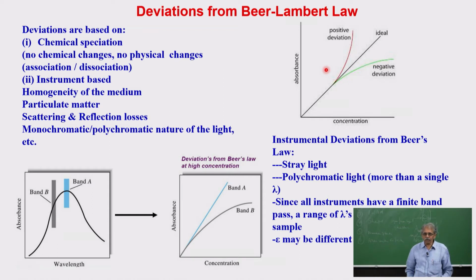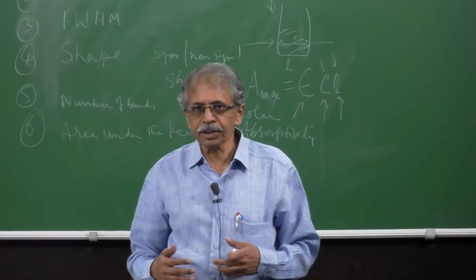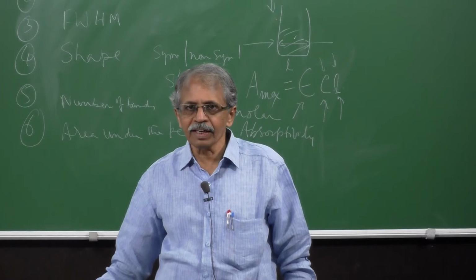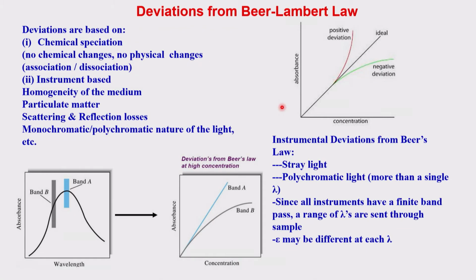These kinds of corrections are already well known, nothing to worry much about for the spectral implications and explanations. Only in quantitative analysis do people use this, but these are all very well taken care of now by the instruments by making appropriate subtractions. So not too much to worry about on this aspect. Your spectrum does not grossly change; the quantifications would change.